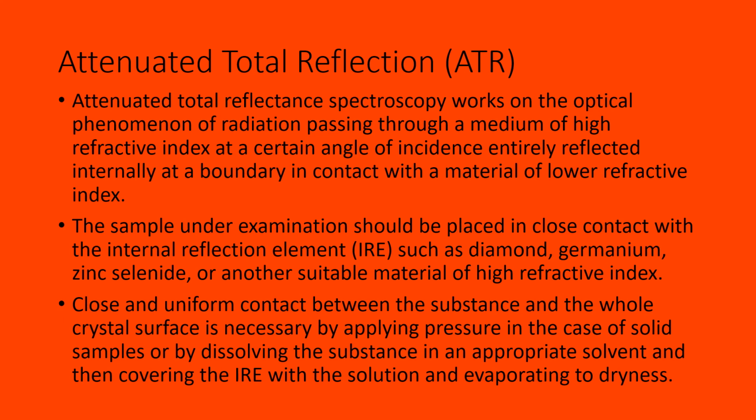Close and uniform contact between the substance and the whole crystal surface is necessary, by applying pressure in the case of solid samples, or by dissolving the substance in an appropriate solvent and then covering the IRE with the solution and evaporating to dryness. In this technique, the sample is used without any support of KBr pellet.